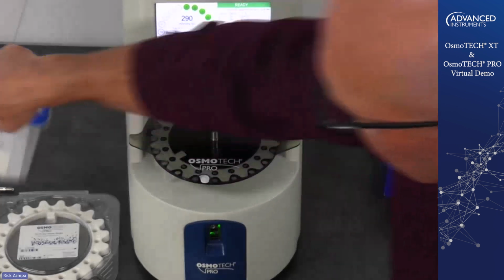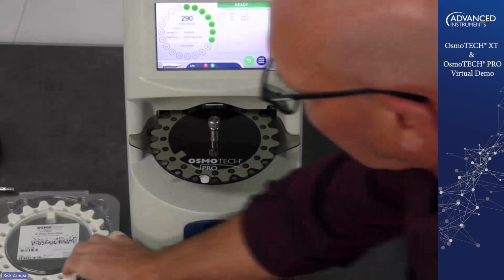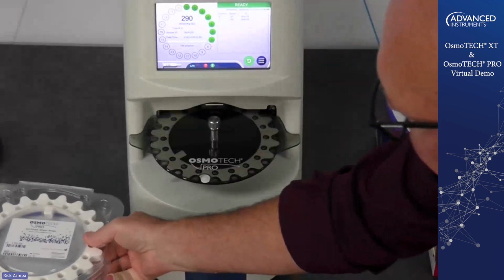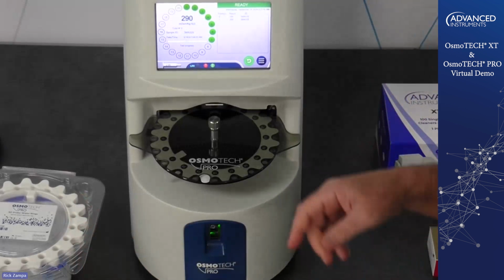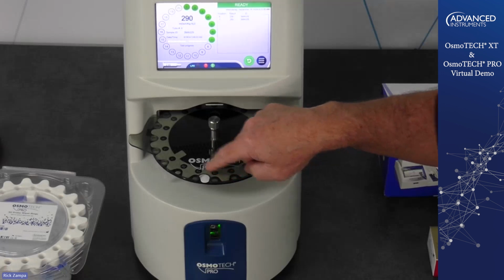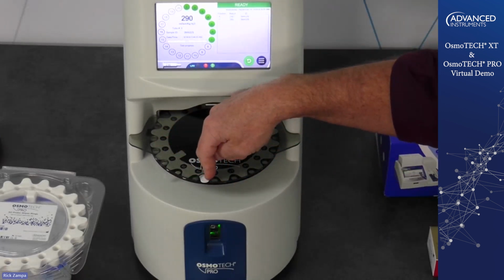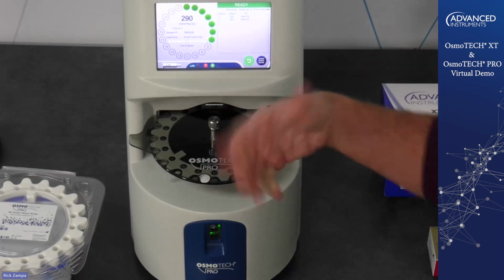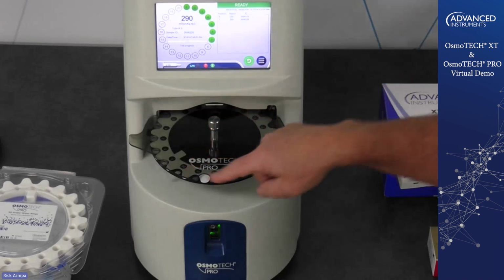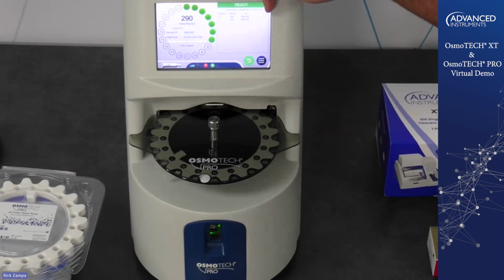So the consumables on this is a box of 500 sample cups and a cleaning ring, or a wiper ring as we call it. When I zoom in, you'll hopefully be able to see. So the wiper ring is here on the turntable. You might be able to see the white spot there. That's the wiper ring. After every sample, the sample probe punches through this wiper ring and cleans the sample off and assures that you don't have any carryover. Very similar to what I did with the chamber cleaner, only this is automated and on the turntable here for you. So you can see the instrument says it's ready to go.